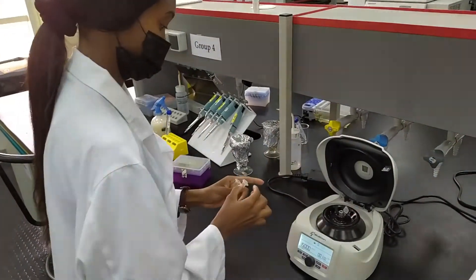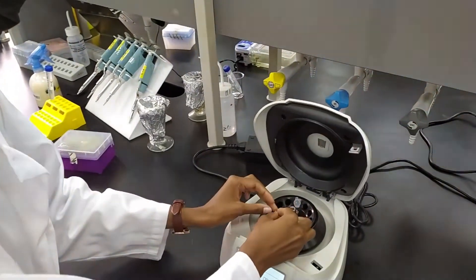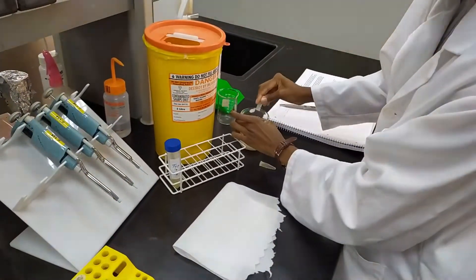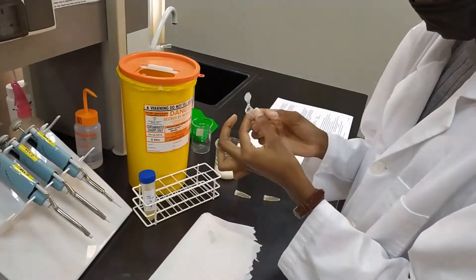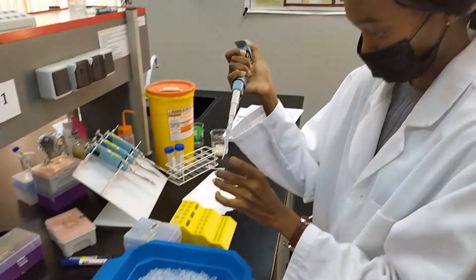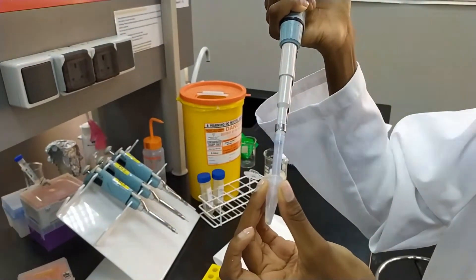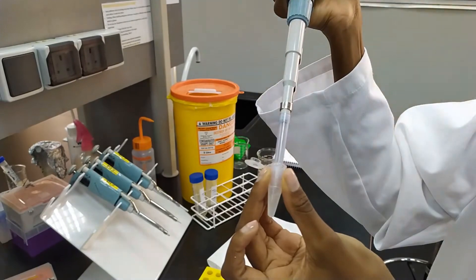Once ready, you will spin down these cells in a microfuge to separate them from the media. Don't forget to balance your tubes. Next, you will remove the media from the pellets — make sure to tap the tubes out well. Then resuspend the cells in some cold calcium chloride, very gently by pipetting up and down. Be sure not to vortex. Once you have them resuspended, you will spin them down again in a centrifuge and repeat the resuspension in calcium chloride again.